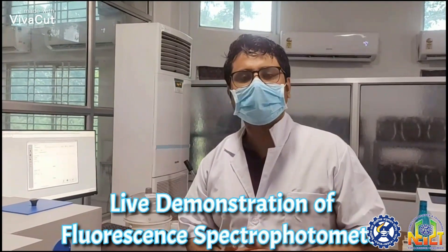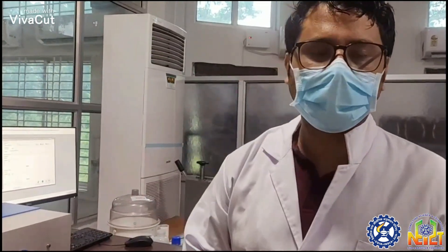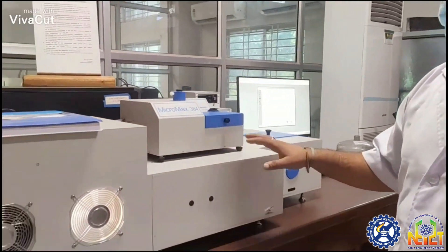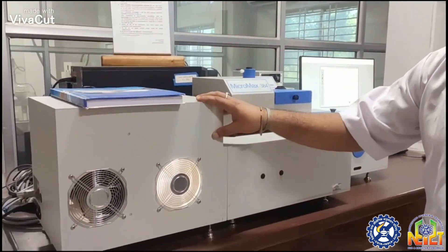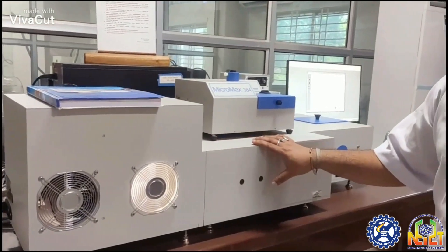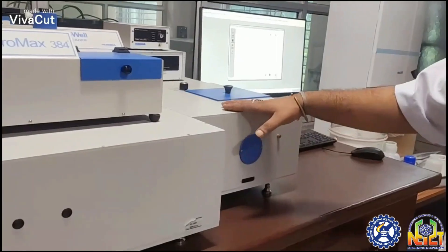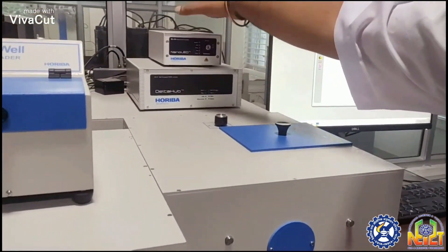This is the Fluorolog3 spectrophotometer instrument. It has a light source unit followed by an excitation monochromator, then a sample compartment, followed by an emission monochromator, and finally the detector at the output.